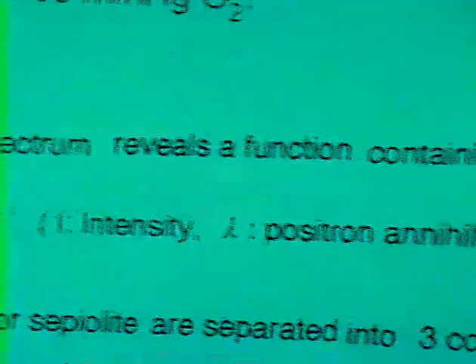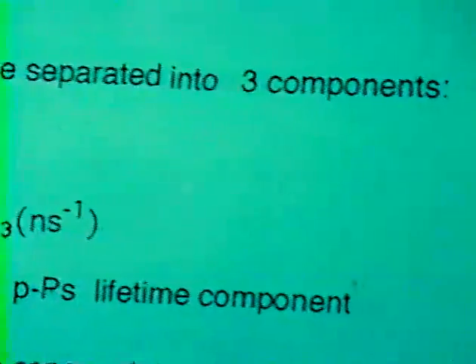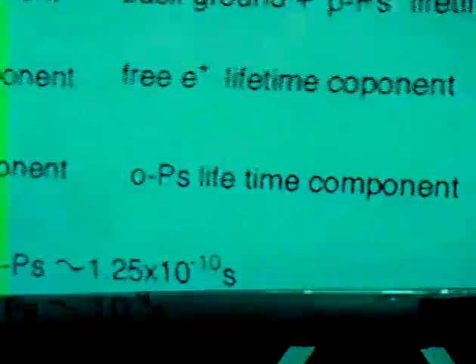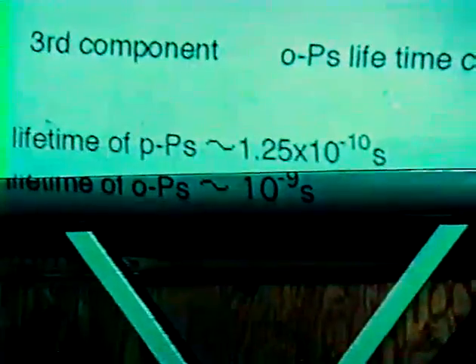So, for the effect of oxygen absorption, we measured the lifetime spectrum. Typical lifetime spectra of sepiolite in the vacuum and then in oxygen are shown in this figure.